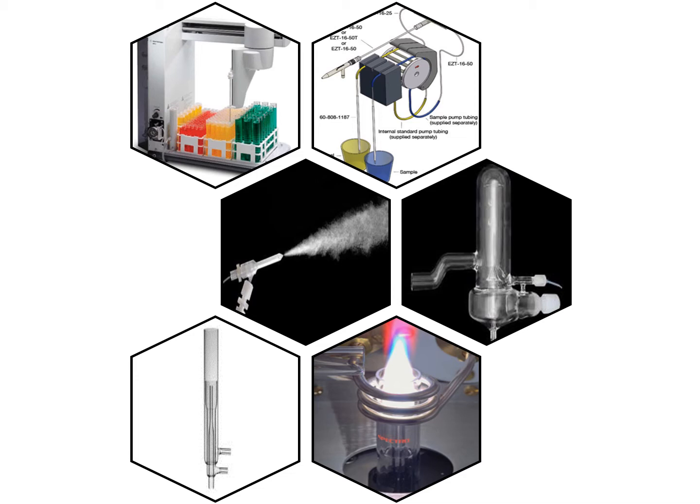So another issue, because this is so hot, okay, 6,000 Kelvin, that's the same temperature as the surface of the sun. Okay, so it's giving out intense ultraviolet radiation. So when we use these, they have to be in a box. Okay, because if they didn't, we'd all get cancer and a really good tan.